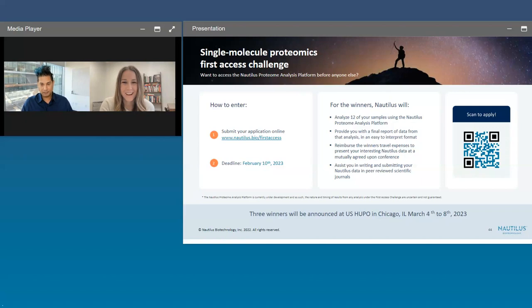Thank you for that. Another question here. What are the factors to consider for false identification and quantitation? So that's a really important question and something we think about a lot. I'll really focus on the false identification part because that rolls up directly into quantitation, as I mentioned before. So when we think about false identification, the way we think about it is very similar to mass spectrometry-based proteomics techniques. What's the likelihood that a given identification would be incorrect? And what are the factors that drive that?